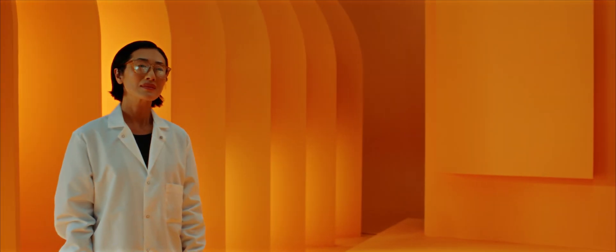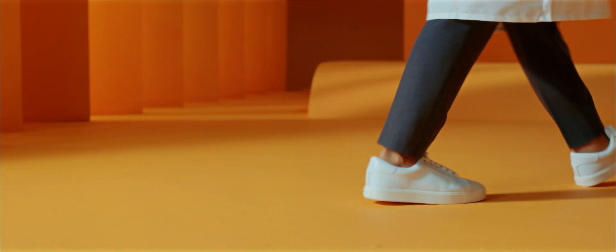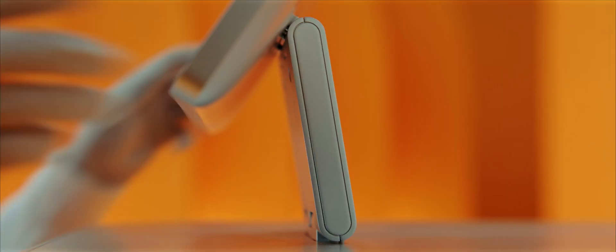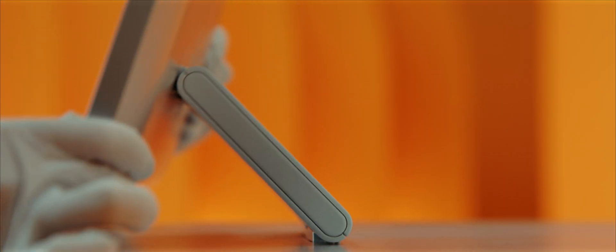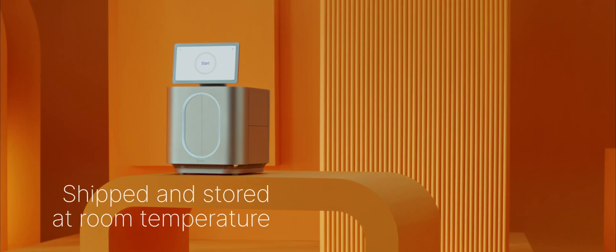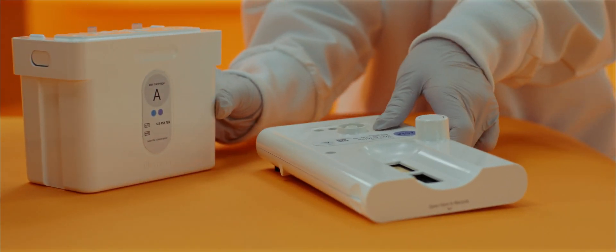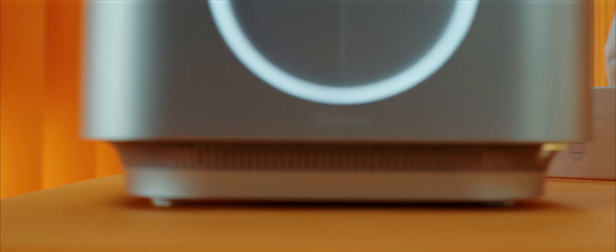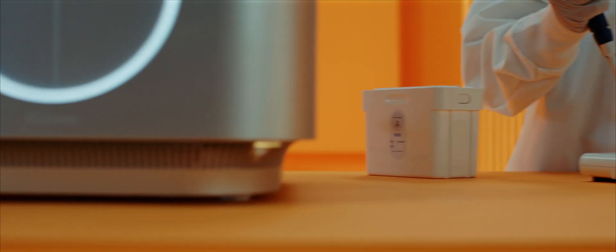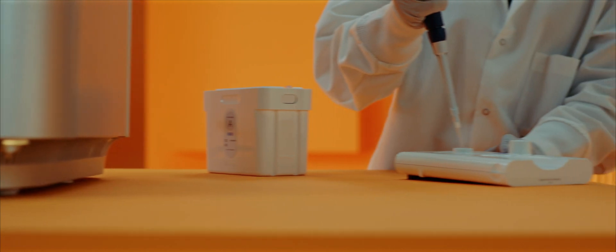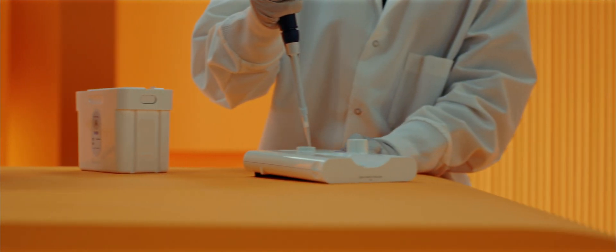The MySeq i100 series is simple at every step from setup to data analysis. The reformulated reagents are shipped and stored at room temperature, eliminating the need for freezers. There's no need to wait to thaw your consumables before starting a run.